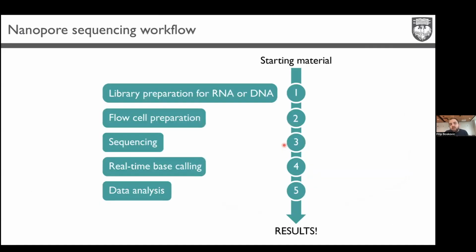So the simplest way to include, if let's say today I want to do experiments, basically I would need to buy a device or to use a device that's available in the core facility. You will need the flow cells, and you will need the kit for the preparation of your sample. So nanopores enable direct RNA and DNA sequencing. If you want, of course, you can do PCR, copy it into multiple copies, and therefore have even higher throughput.